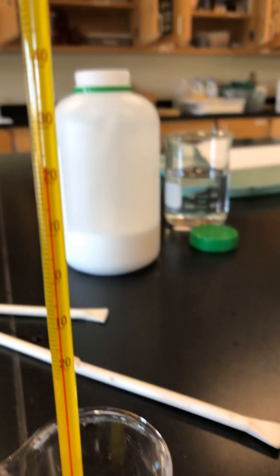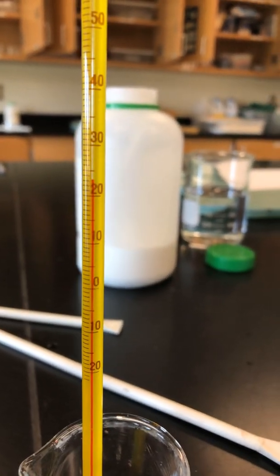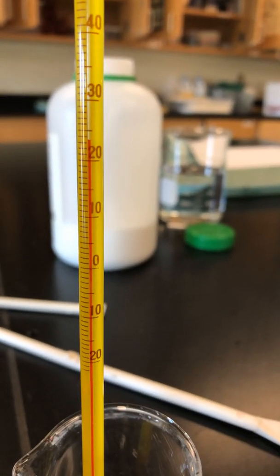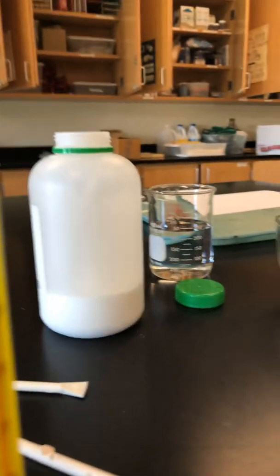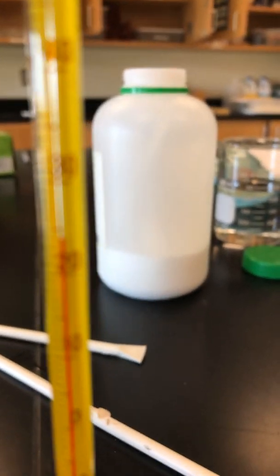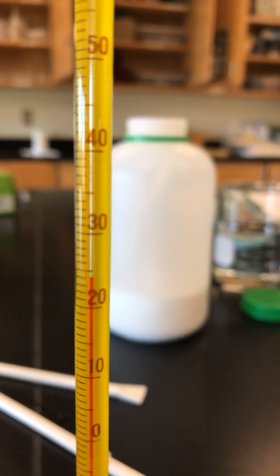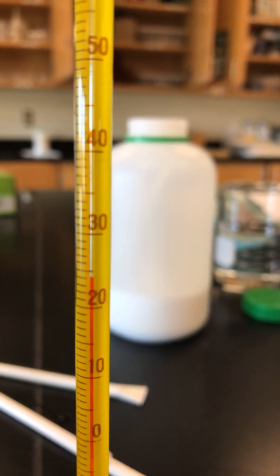So we don't record a temperature until that red liquid, which is an alcohol with red dye in it that is not mercury. Okay, so the temperature seems to have stopped changing. Try to move in a little bit so you can maybe read that thermometer a little bit better. There you go. So record that as salt C, our third trial's initial temperature of the water.